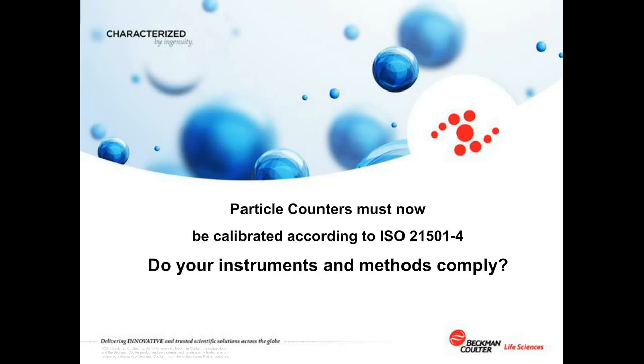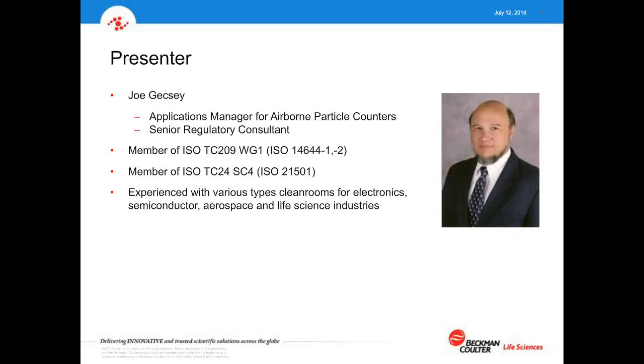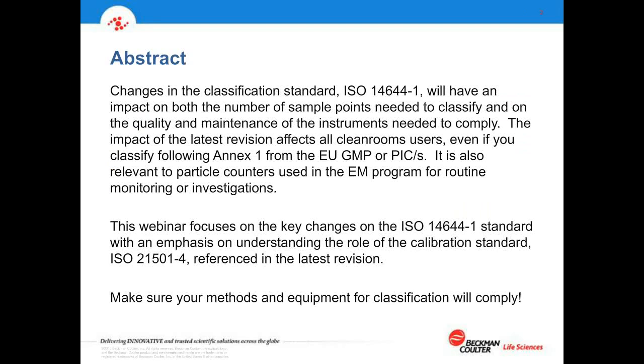Thank you, Judy. Good morning, and thank you for joining us. We'd like to follow today's talk with questions. I'm sure that people have various concerns and questions about both the ISO 21501 as well as the 14644. So I'm happy to speak about that and address all those concerns, and hopefully get all the questions answered at the end. I've been involved with some of the various standards, and there are always questions as new standards are brought forward. None of them are ever quite perfect, but certainly they have an effect on us, and it's good to have the chance to have dialogue about it.